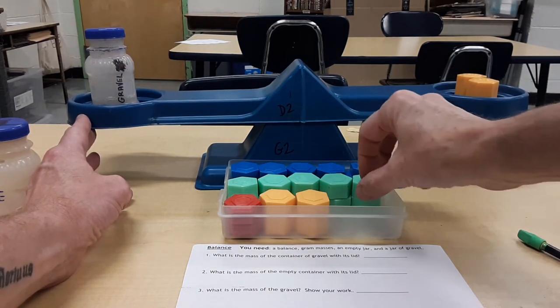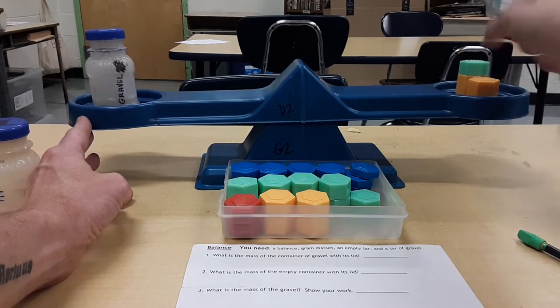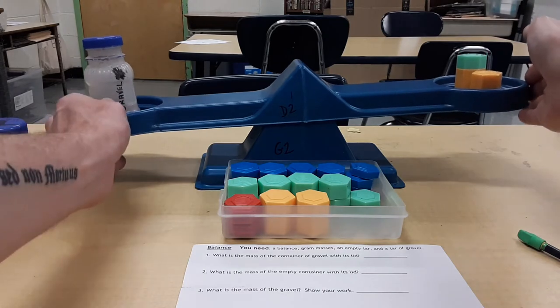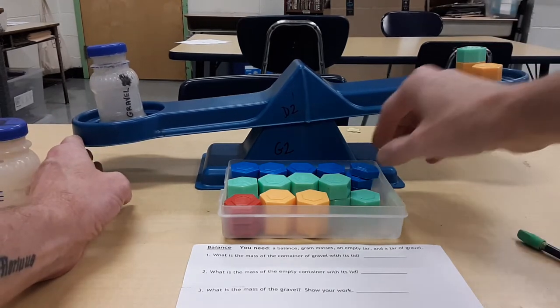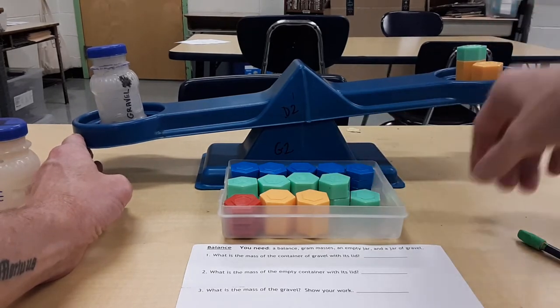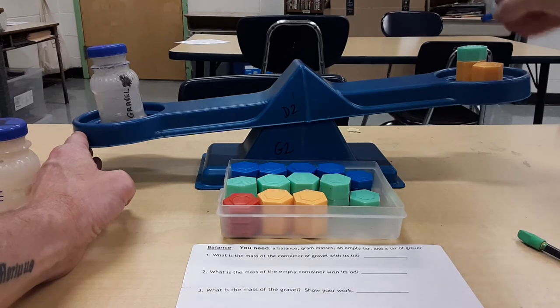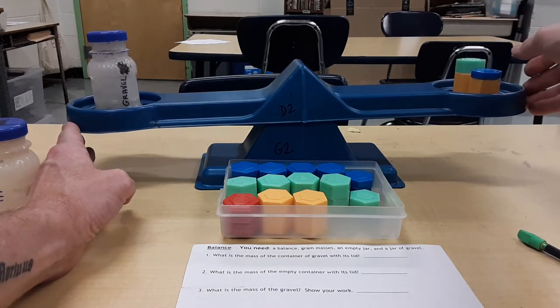So since another yellow was too much, we now try a green. Remember, you only make two piles. Double check, make sure everything's in the middle. This moved a little bit, so I'm moving it back. And that's not enough. Okay, so I know I can't add another green because that would be the same as this, which was too much. So now I try a blue. Still making only two piles.